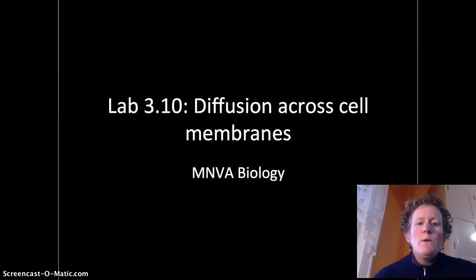Hello, biologists. We're going to do lab 3.10 today together. We're going to talk about diffusion across cell membranes.